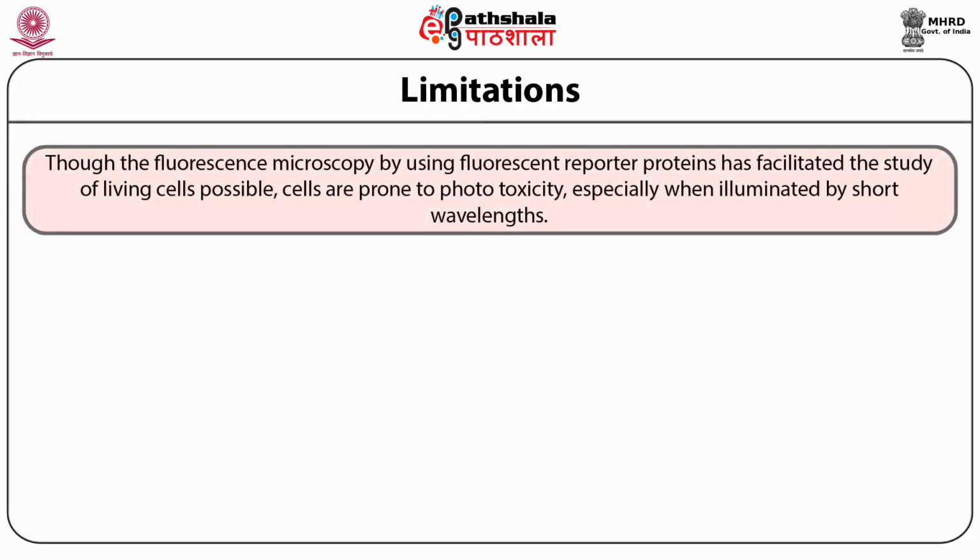Though fluorescence microscopy, by using fluorescent reporter proteins, has made the study of living cells possible, cells are prone to phototoxicity, especially when illuminated by short wavelengths.